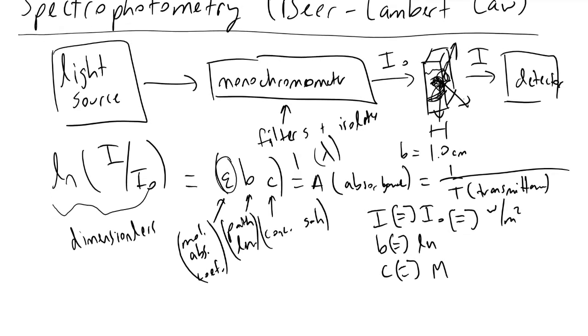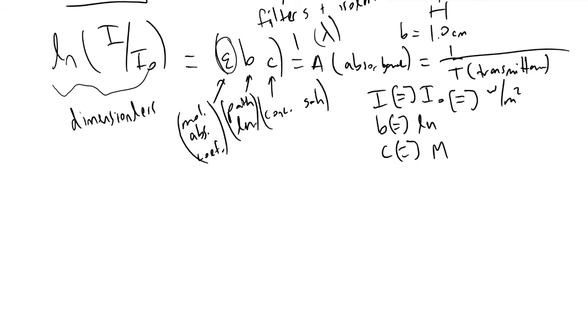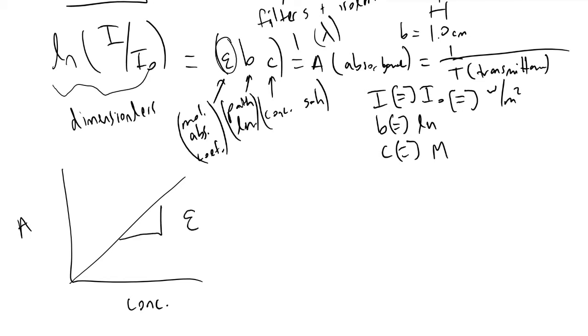And to give some more background on this, when we develop our standard curves in practice, what we do is analyze the absorbance, A, versus the concentration of your solution. We will get an initial linear relationship between A and concentration, and the slope of this will have a value corresponding to epsilon, which was our molar absorption coefficient.